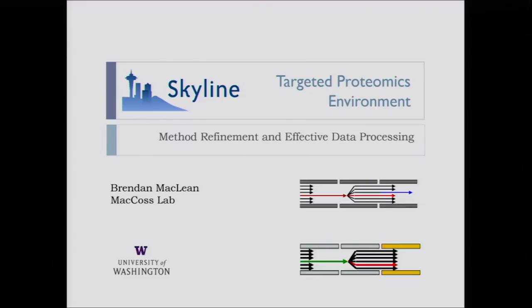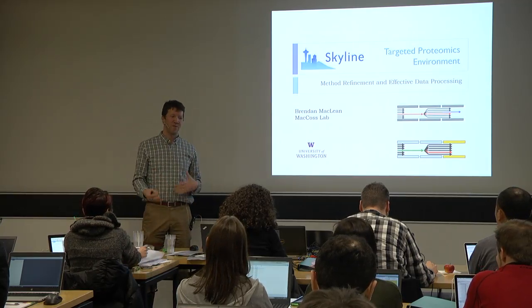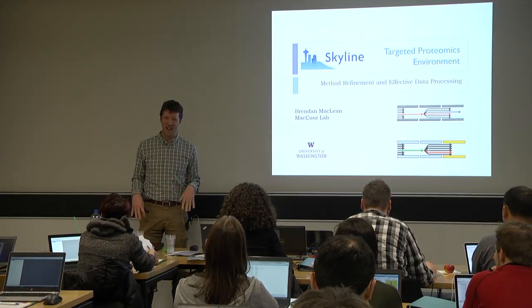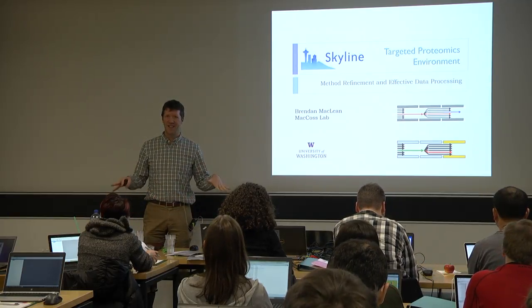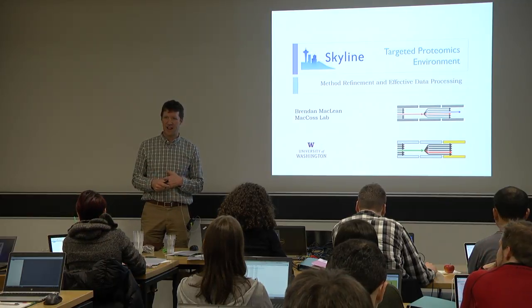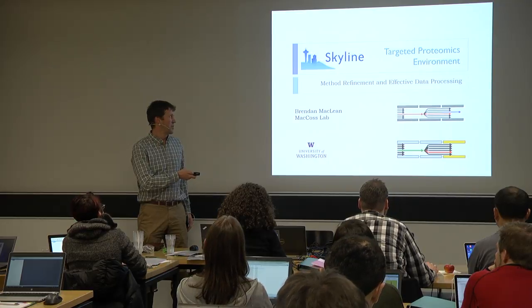So you've all been doing tutorials on your own and learning about Skyline, and now I'm going to actually have you follow along and see how I use Skyline, and hopefully you'll learn a lot. I've had people say that just the act of following along on a more complex data set can be very instructive. So what we're going to look at is a data set.